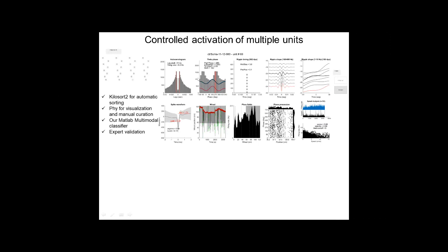We also collect information about where the cell is firing along theta, whether it fires in the falling phase of theta in these particular cells. We can also track the participation of the cell during sharp wave ripples, using information of the ripple power or of the sharp wave shape of the filtered traces, as I explained before.